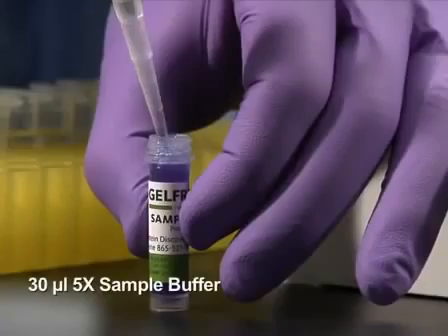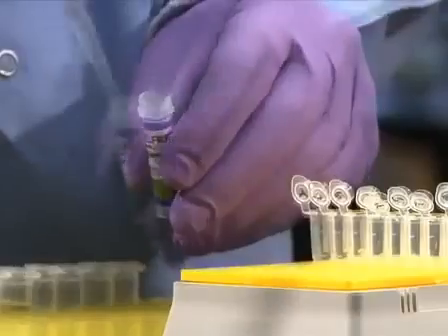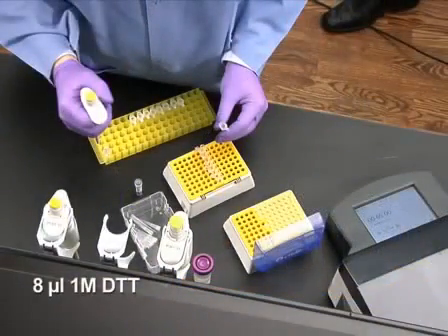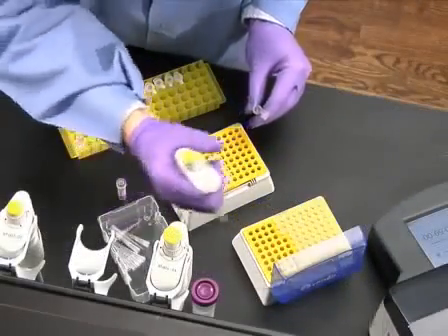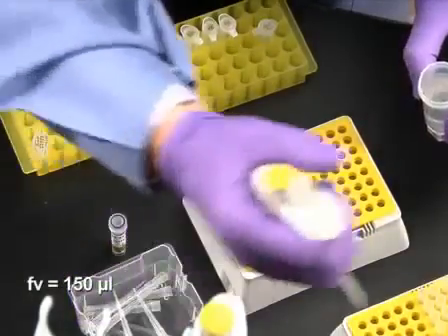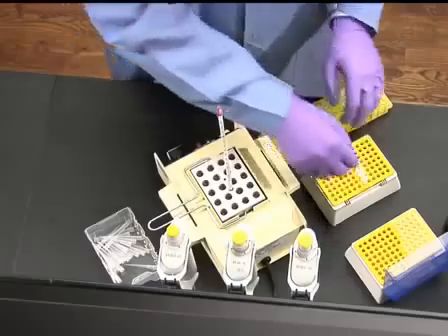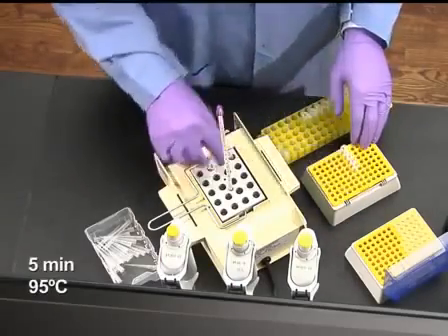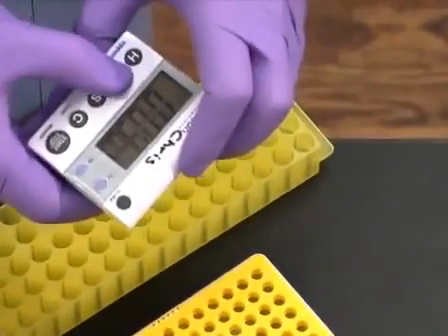Next, add 30 microliters of 5x sample buffer, which is provided in the gel-free cartridge kit, to each protein sample. Add 8 microliters of 1 molar DTT, then adjust each sample with water to a final volume of 150 microliters. Then heat the vials for 5 minutes at 95 degrees Celsius to denature the sample.